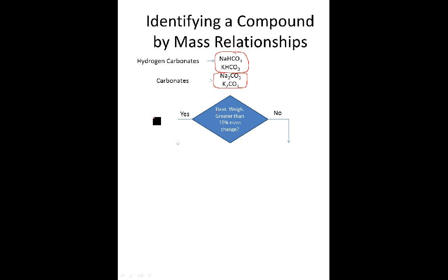Okay, so the way that we're going to be able to do this is using a balance, and this is how much of the work was done for chemistry with guys like Antoine Lavoisier and others like Dalton, who basically had a balance, and they were able to determine what they had using mass differences in their understanding of molar masses and changes in that. So what you're going to do for the first step is take your unknown, and you don't know if it's one of these 4, but it'll be one of these 4, and you're going to heat it.